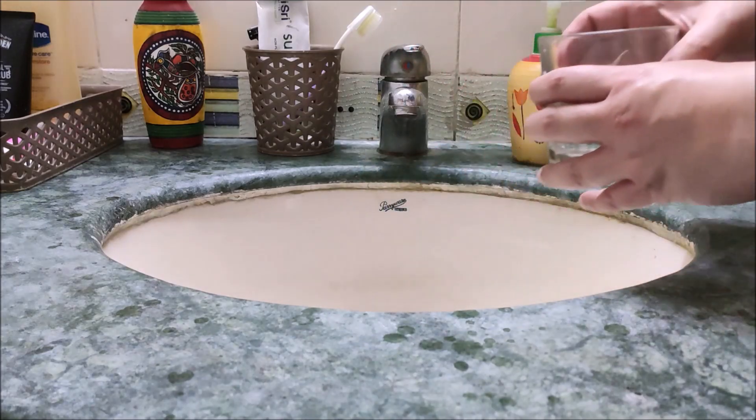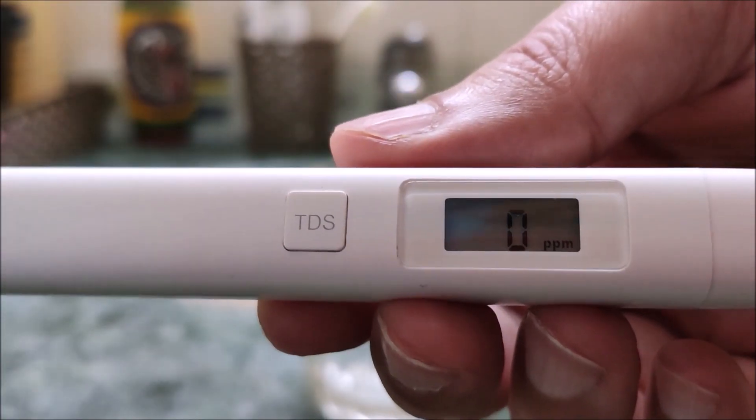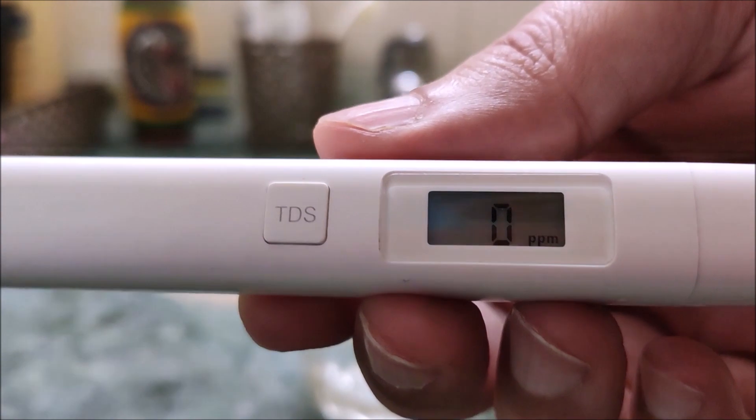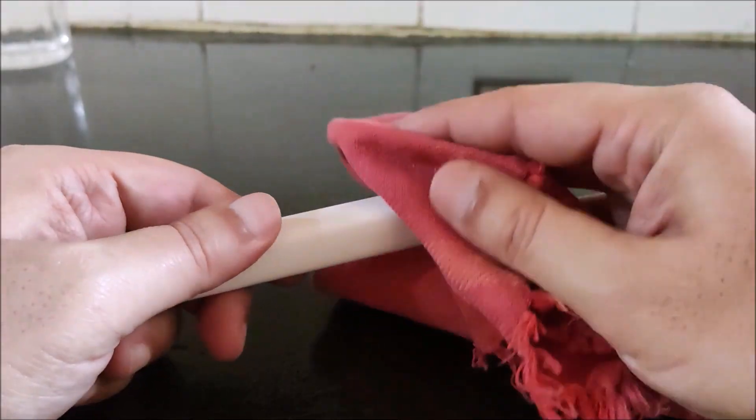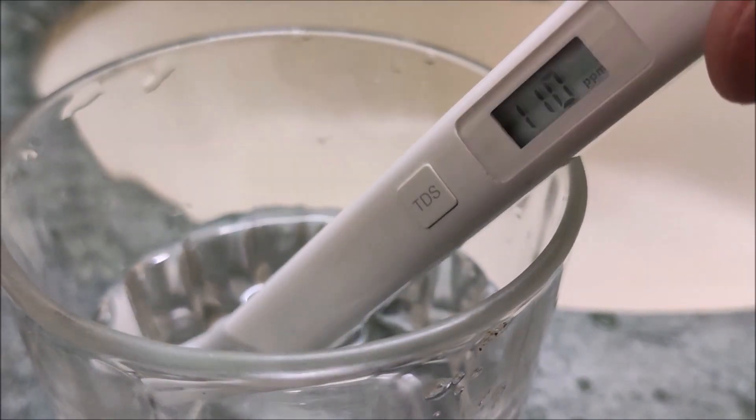Now let us check the tap water. I will switch on the device and ensure the reading is 0. Always dry the device as much as you can before testing — you can clean it with a cloth or tissue. The TDS reading of the tap water is showing 110 ppm.